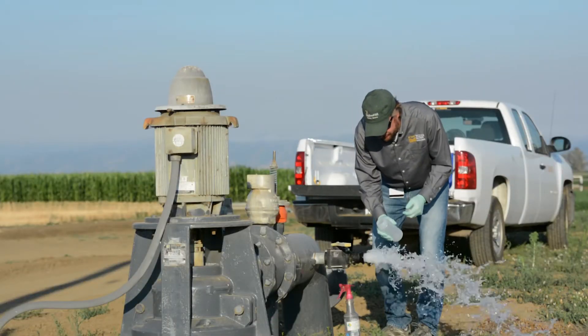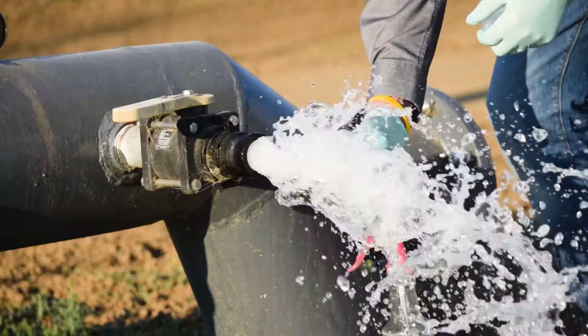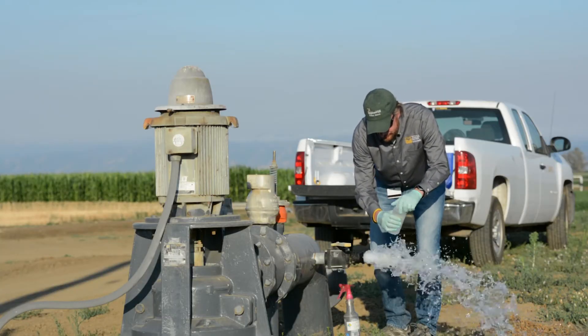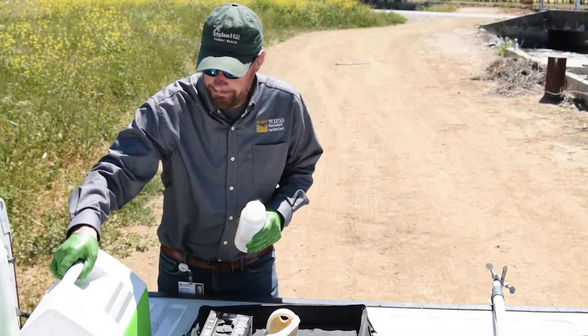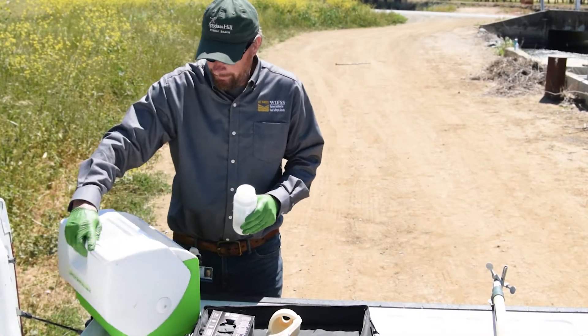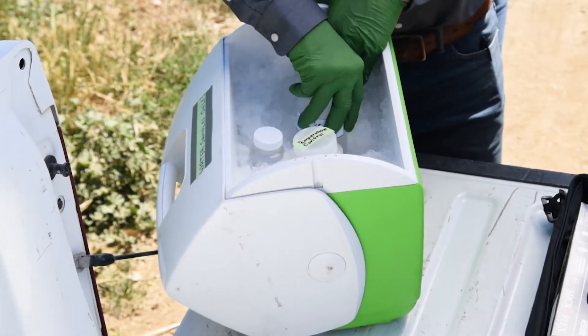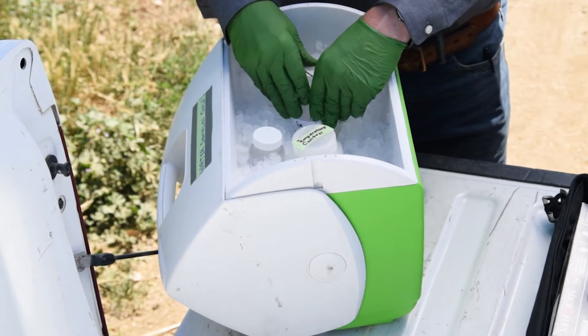Remove the cap and keep it clean. Fill the bottle up to the shoulder. Replace the cap and put the sample on ice. Place the sample upright on ice up to the sample level.